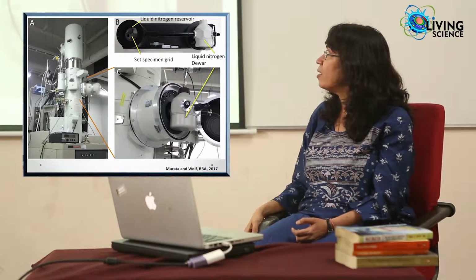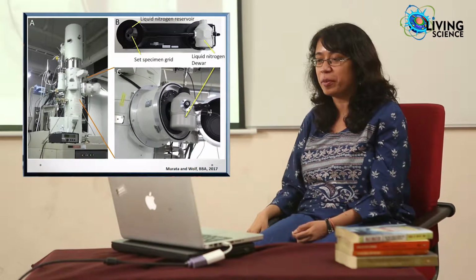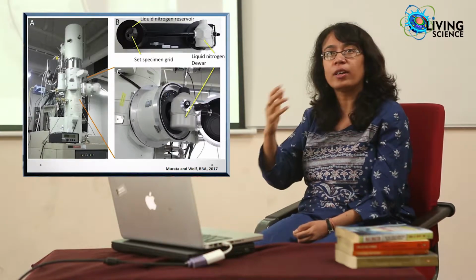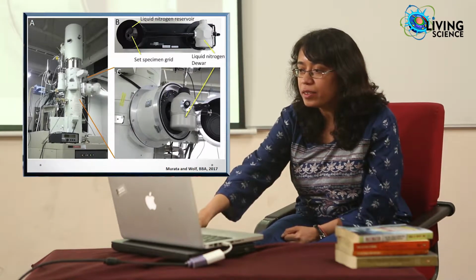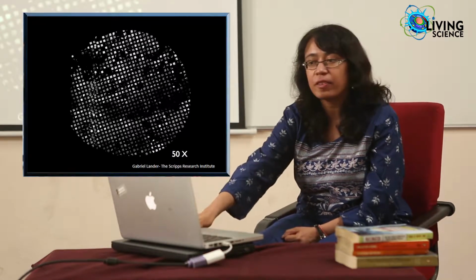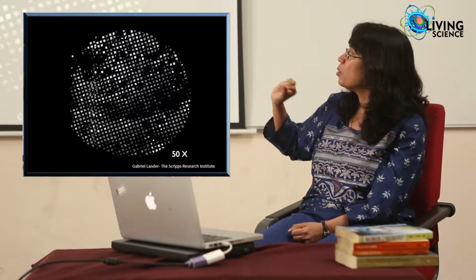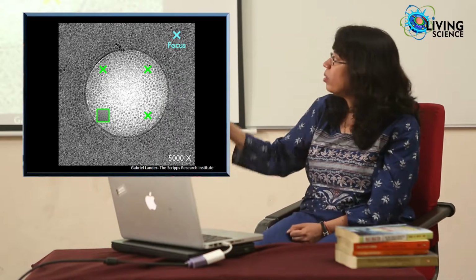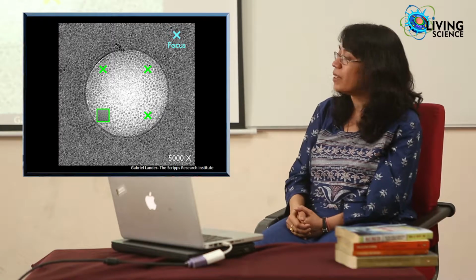Now, this shows a standard, or at this point relatively old-fashioned, side entry microscope. And your grid goes in there, and it's being continuously cooled by liquid nitrogen coming from a dewar. And then this is visualized in the electron microscope. So as one increases the magnification, gradually the features of the grid become visible. So this consists of many grid squares, and in each grid square there are these holes where the sample has vitrified, or is suspended in amorphous ice.